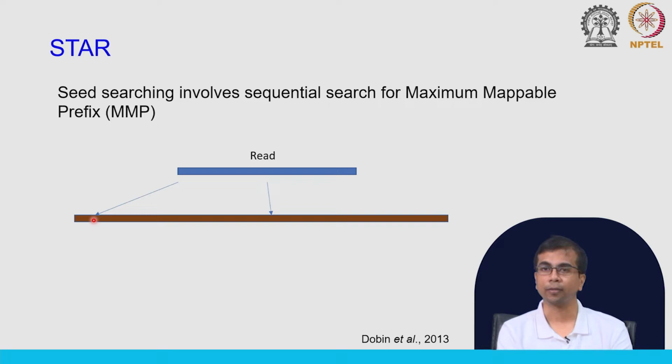We talked about this before. What it means is that it is trying to extend the alignment across the genome, and let us say up to this point here, it finds a match, and after that the match falls, the quality of alignment falls. This is expected for RNA-seq data, because we need to have this gapped alignment, and the intron regions will not be part of the read, because they are not part of the processed RNA.